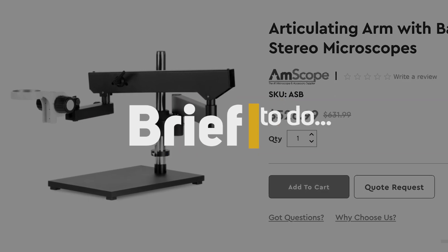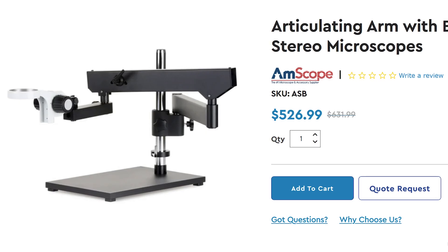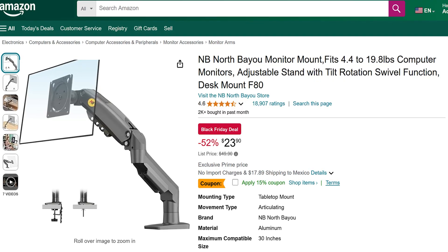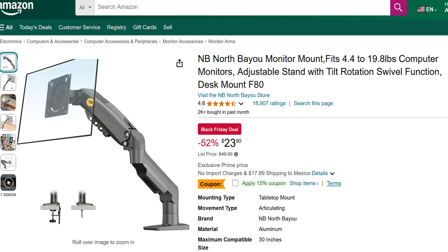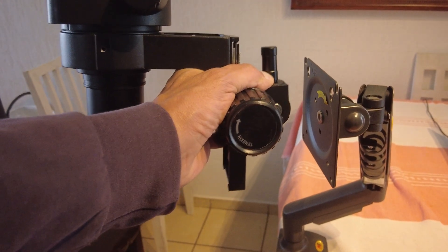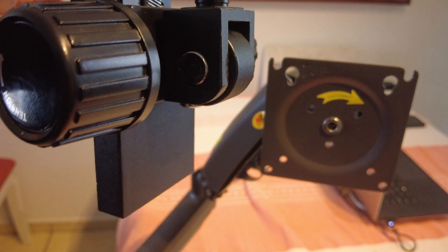Why are articulated microscope stands so expensive? On the other hand, you can find an excellent articulated monitor stand for a very low price, and they are more than capable of holding the weight of a microscope. If only we could make these two interfaces hold firmly together without breaking the bank. Let's make it happen.